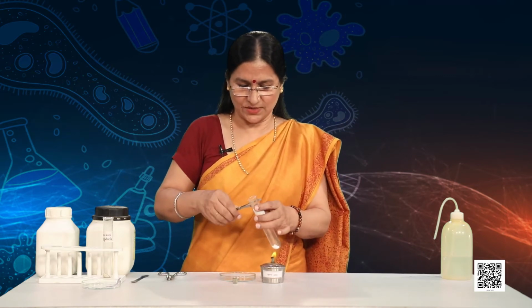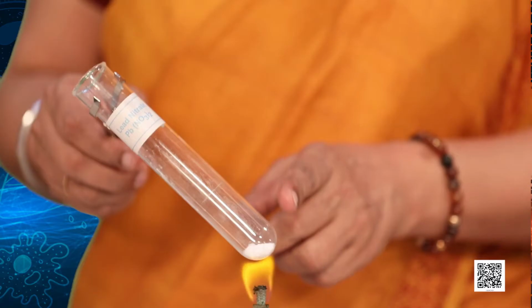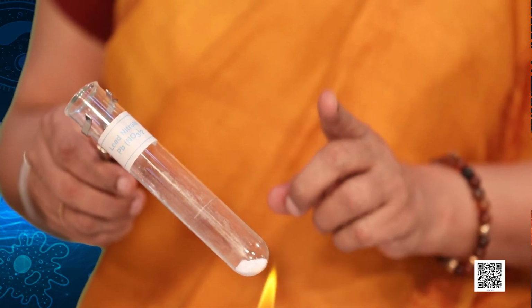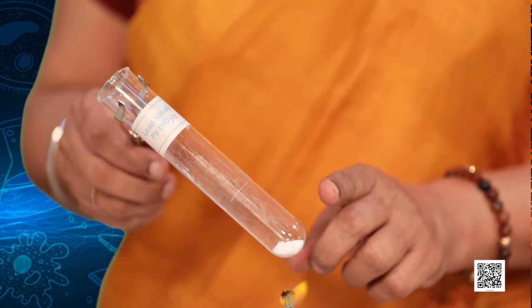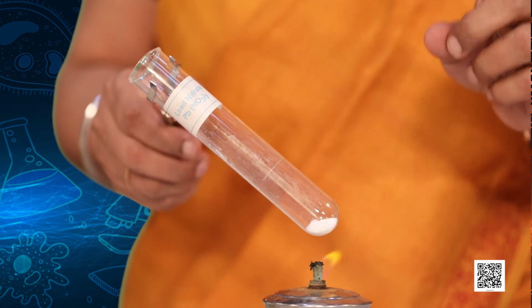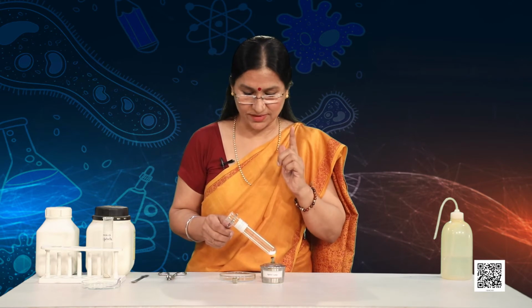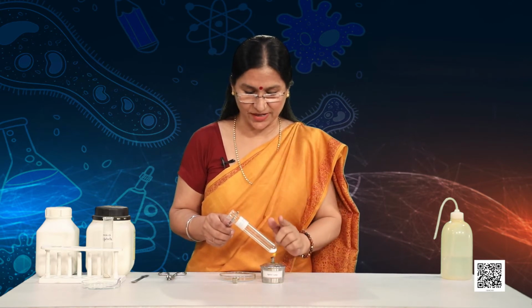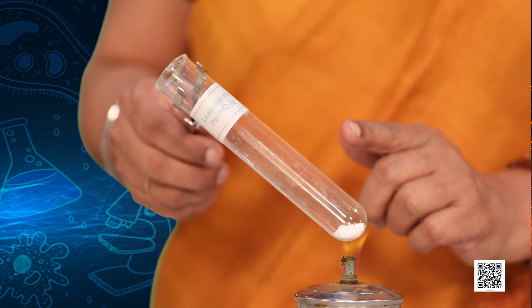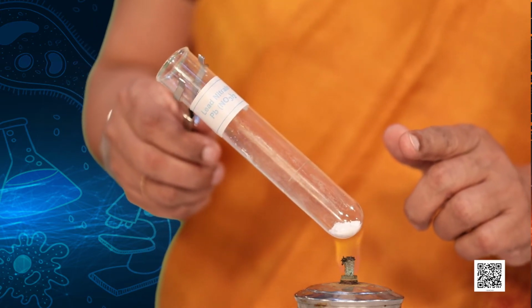I am holding this tightly with a test tube holder and I will be heating it. Again, keeping this, remember, at an angle of 45 degrees. And yes, note the color of the lead nitrate, because slowly there is going to be a change. This is what the magical world of science is about. Again, I can hear a crackling sound. That means the reactant has started breaking down. And yes, children, always remember that the mouth of the tube should never be pointed at your neighbors or your own self. You have to be very careful.